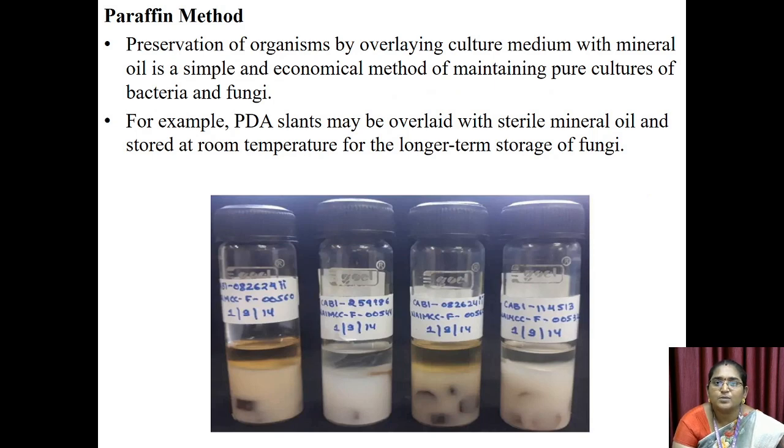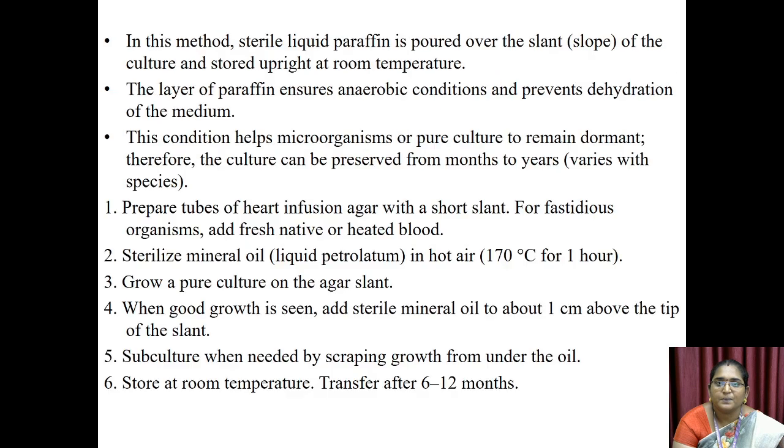Preservation of organisms by overlaying culture medium with mineral oil is a simple and economical method of maintaining pure cultures of bacteria and fungi. For example, PDA slants, that is potato dextrose agar slants, may be overlaid with sterile mineral oil and stored at room temperature for the longer term storage of fungi.